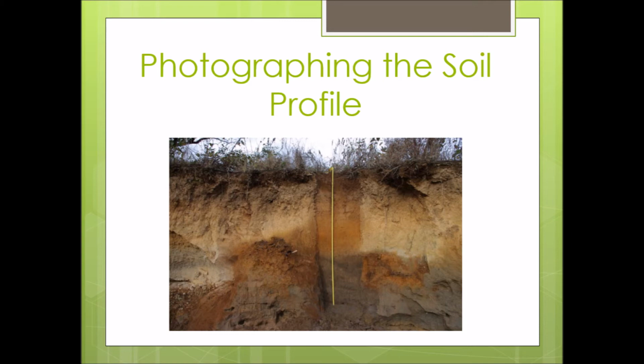None, if you observe no reaction. That means the soil has no free carbonates presence. Slight, if you observe very slight bubbling action. This indicates the presence of some carbonates. Or strong, if there is a strong reaction, meaning that there are many or large bubbles. This indicates that many carbonates are present.